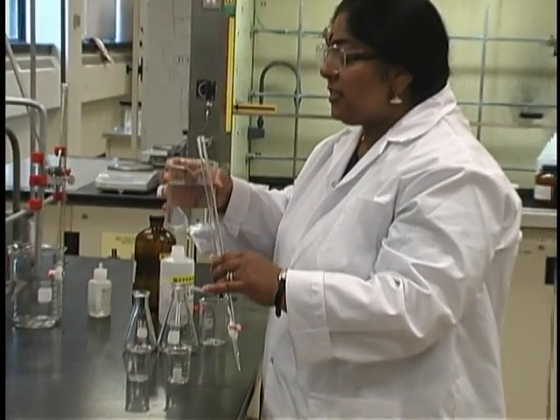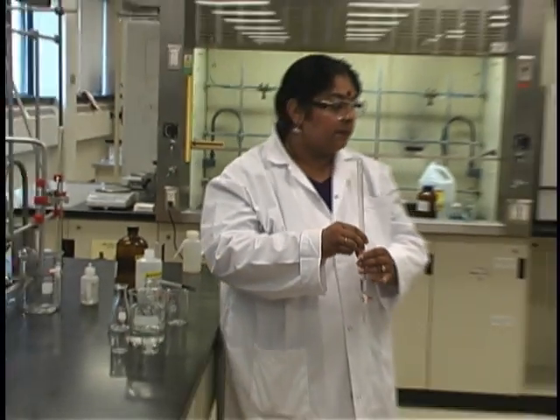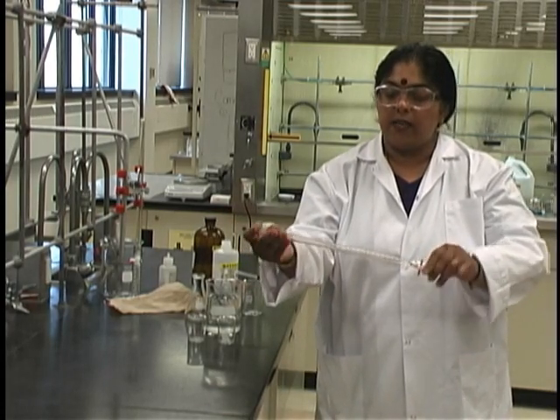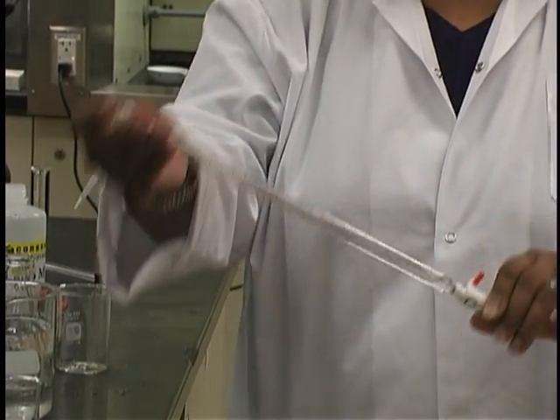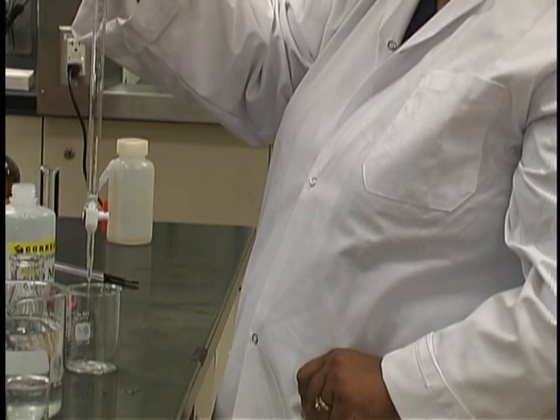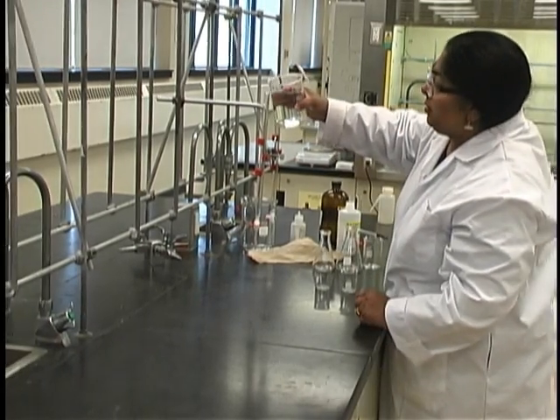This will ensure that your burette will contain nothing but what you want it to have. For example, if you are going to place the base solution in your burette, add a small amount of the base, then obtain a piece of brown paper to use as a small plug and gently rotate the burette to allow the solution to pick up anything that may be in the burette. Make sure to drain this through the bottom by opening the tap, then replace the burette, close the tap, and now you may fill the burette.